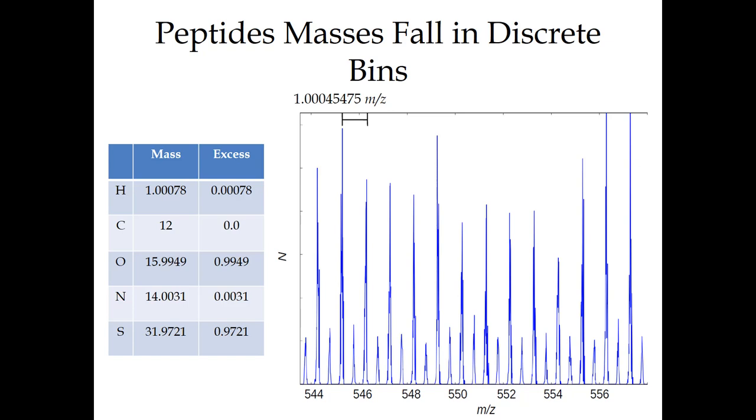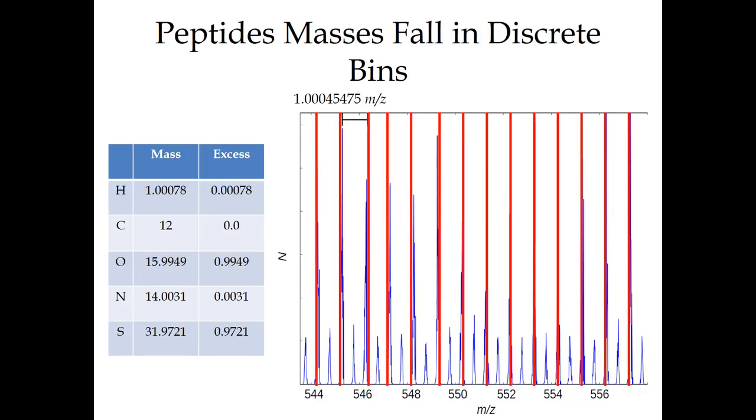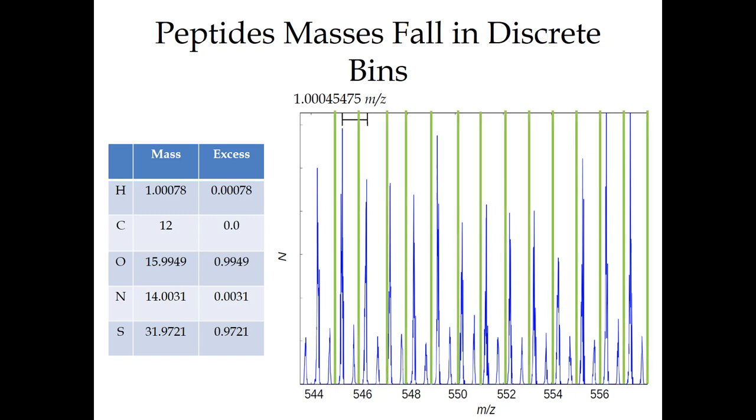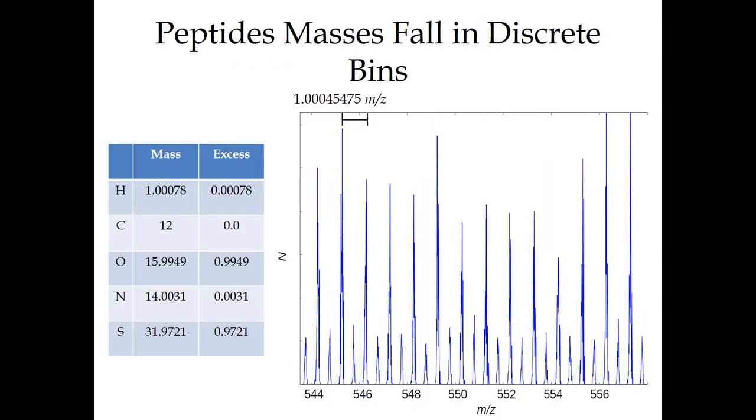So you end up realizing that you have this sort of distribution, and if you start to think about precursors, like a doubly charged precursor, for example, that's when you get these sort of half masses in between single jumps. But given that the peptides all sort of fall into this range, you can imagine that if you wanted to make the world's worst DIA method, you would have all of the edges right where you know that you're going to have precursors, right? But if you want to make the best DIA method, you just simply have to scoop those windows a little bit, right?